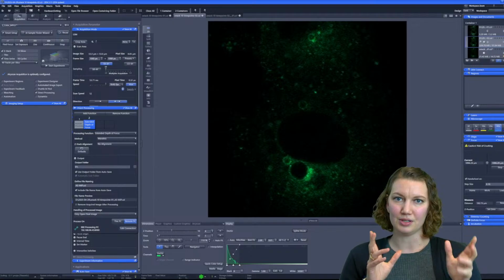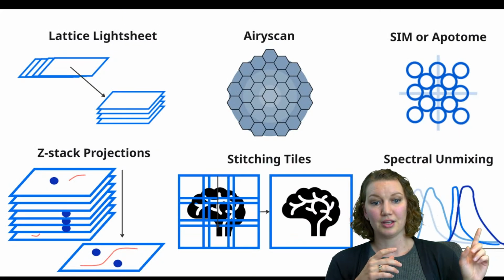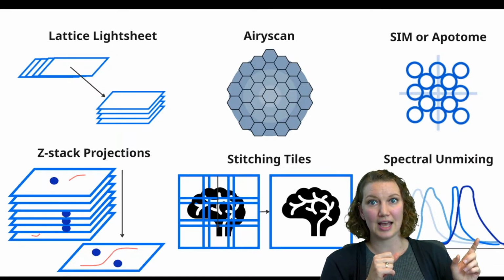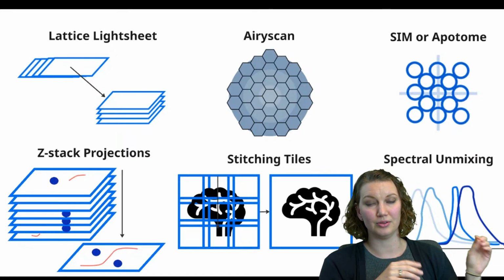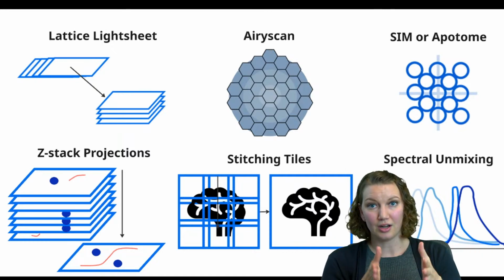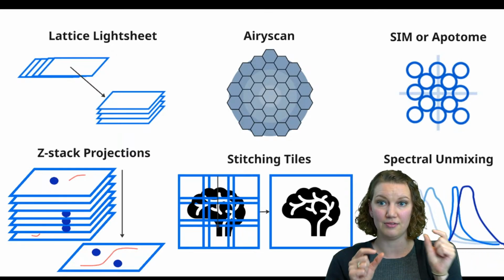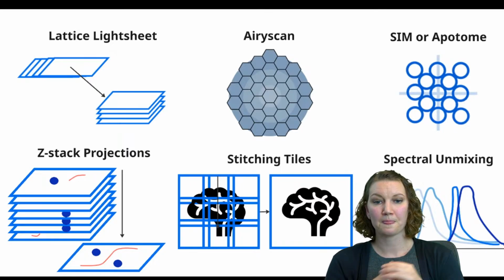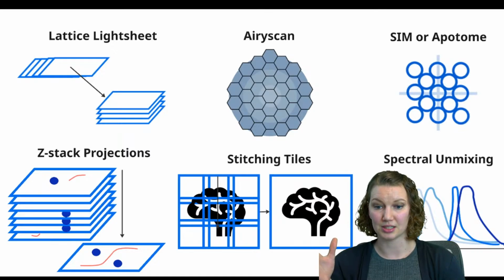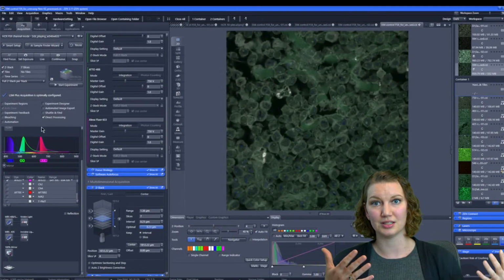One more thing, because I alluded to this, and I also put a link in the bottom of the description. I think spectral unmixing is a really untapped, wonderful way to build this into your imaging experiments. Again, because if you don't cut off in these really narrow bands when you're doing multiplexing, you allow all the light through, but you save individual spectral fingerprints. This is a really powerful way to really get the most out of your multiplex experiments. So I'll just show you, again, another case example of how you could use this. There are so many ways you can build these things together.